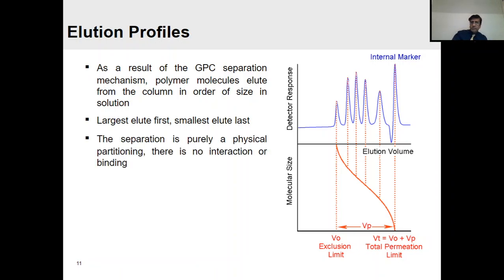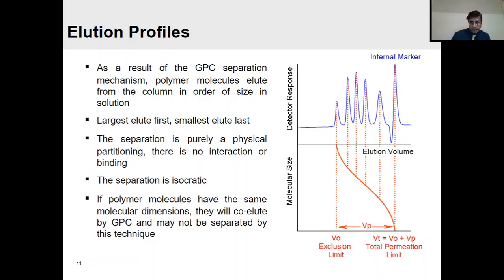The separation is purely a physical partition. There is no interaction or binding, and the separation is isocratic. As I told you, isocratic means throughout the separation process, the composition of the solution remains the same, it does not change.